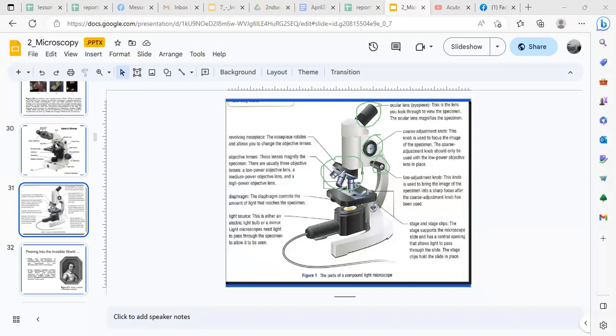So yung low objective lens, yung medyo shorter yung haba. So that's the low objective lens. Usually 4 times. So 4 times dito sa low objective. Tapos yung sa eyepiece mo usually 10 times. So 4 times 10 will be 40 times. Okay? So depende yun sa microscope. Nakalagay naman yun sa mismo objective lens. And then you have the higher objective lens there, medium, and then the high power.